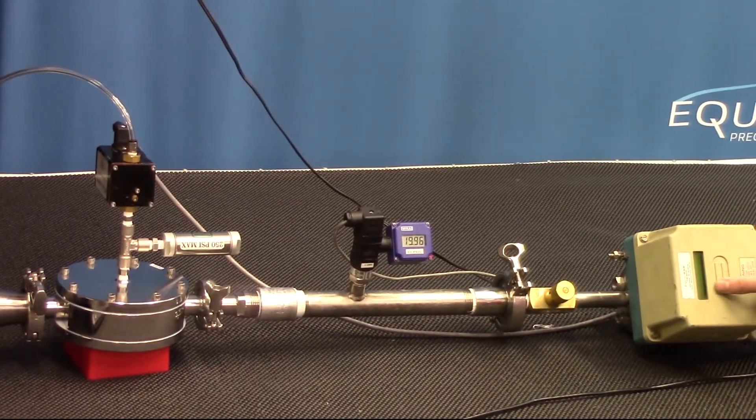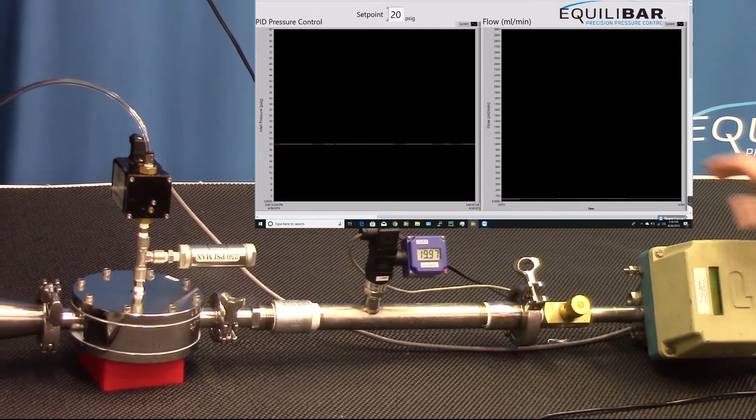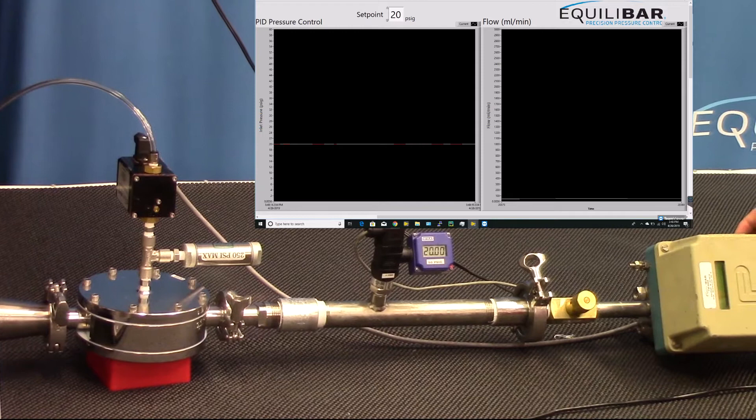To begin, we will start at approximately 35 milliliters per minute of liquid flow, and we can see the inlet pressure gauge is reading almost exactly 20.00 psi.